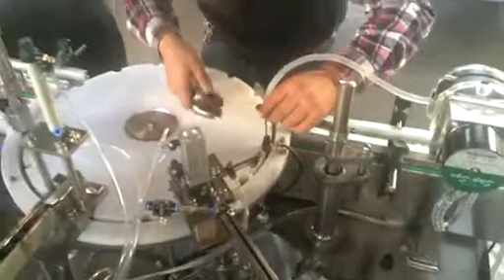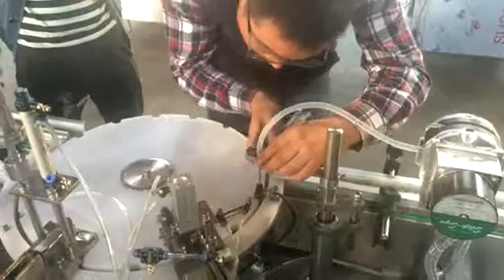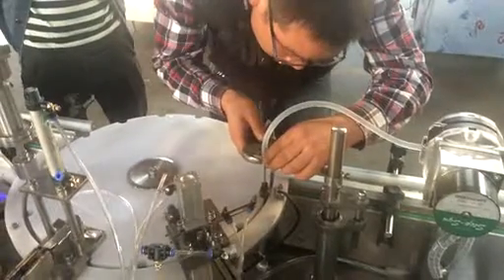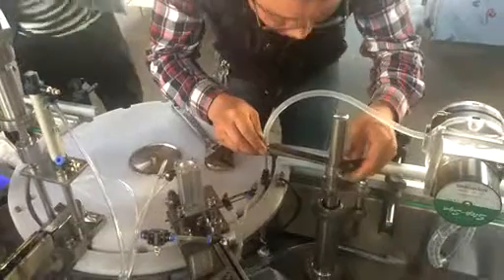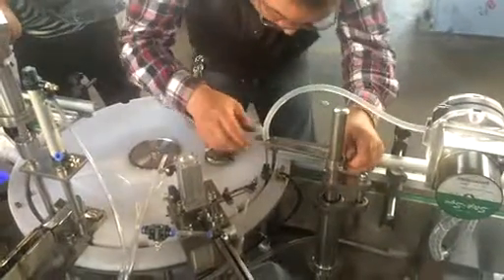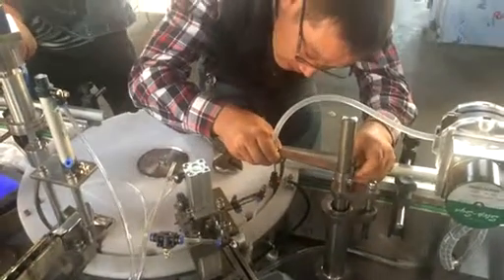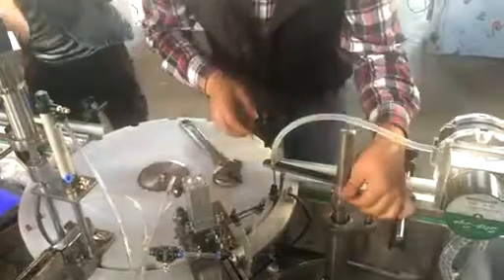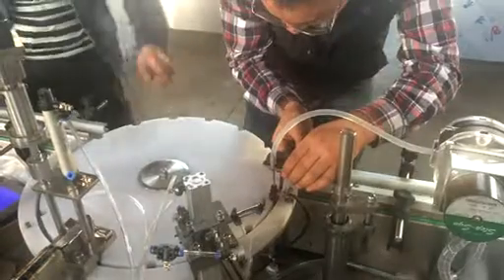The three steps are adjusting the height of the plug, cap, and capping. We are adjusting the height and the center of the plug, cap, and capping, making sure they are in the center of the plug.